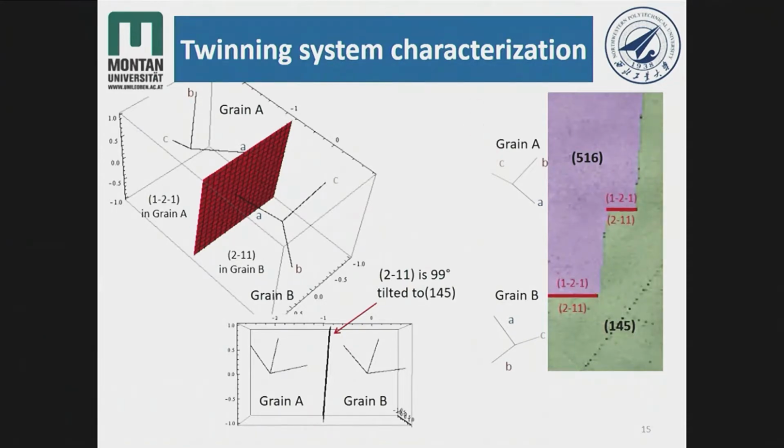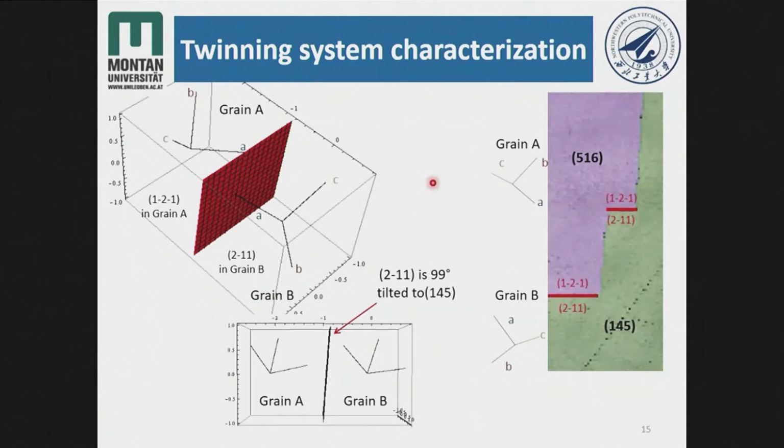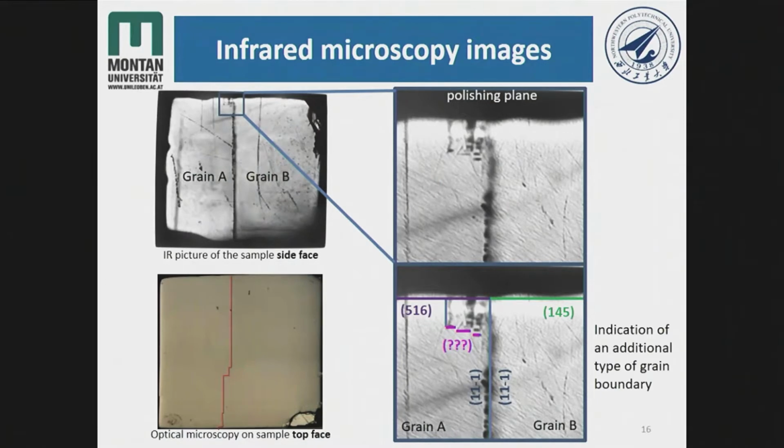And yeah, this fits exactly the angles measured in this topography measurement here before, and explains how these steps within the crystal structure form. And we also needed some 3D information of how the planes are inside the crystal. If we look with AFM from one side, we can also look from the other two sides, but we still are never sure how the twin plane goes through the whole crystal. And therefore we use infrared microscopy.